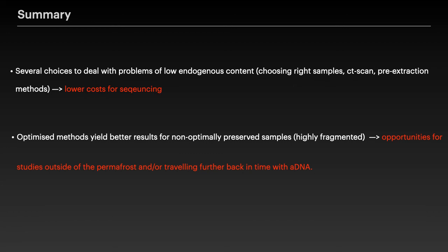We have been using these methods, both the double-stranded and the single-stranded library, in our lab, and they have performed quite well. We've been applying them to several studies in species that lived mainly in temperate environments. With the development of methods, we have traveled a long way in the last 40 years, I can say.